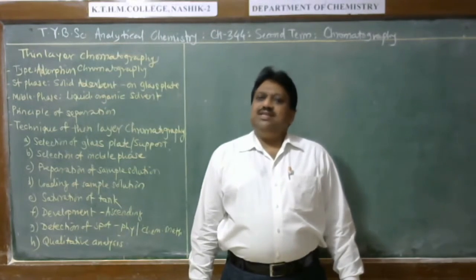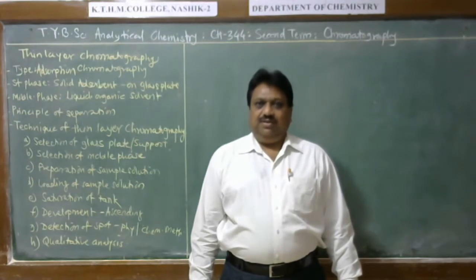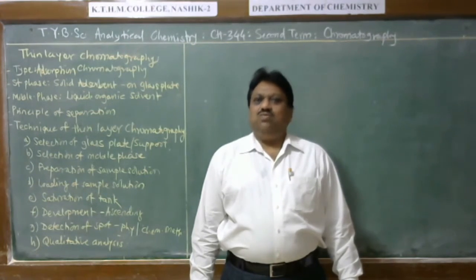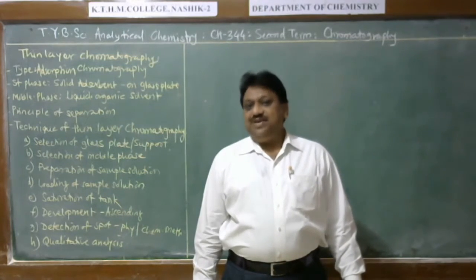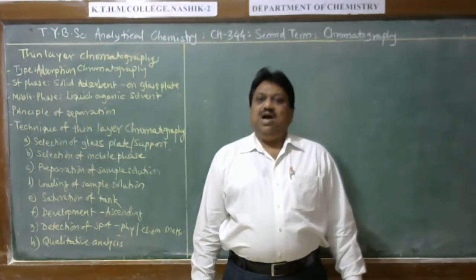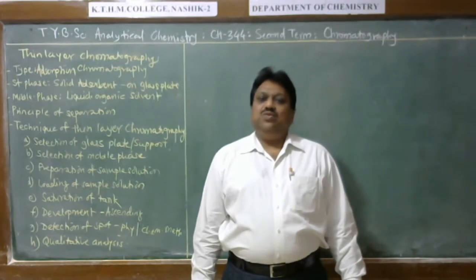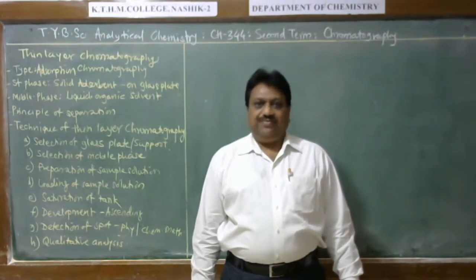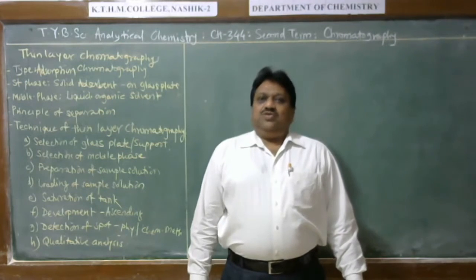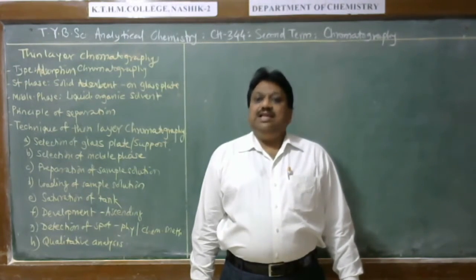Students, in the previous lecture we discussed the technique of paper chromatography. Under this we discussed what the stationary phase in paper chromatography is, what the mobile phase is, and how paper chromatography works. In addition to this, we discussed qualitative and quantitative analysis by means of paper chromatography. Students, in today's lecture we discuss the technique of thin layer chromatography.